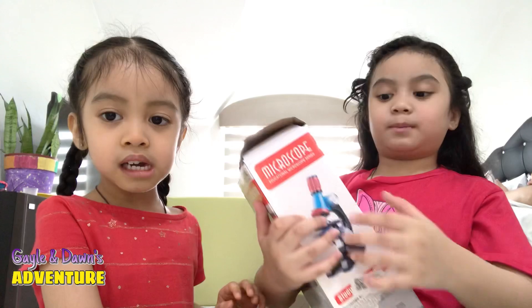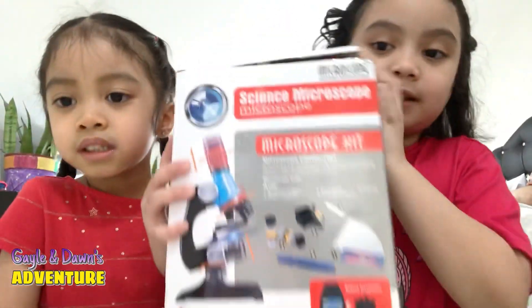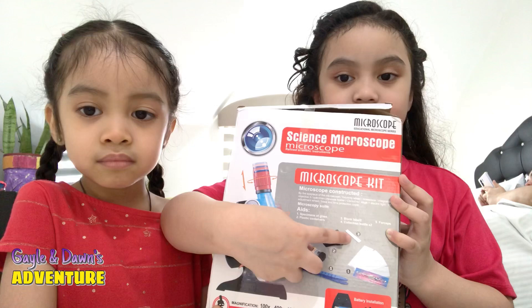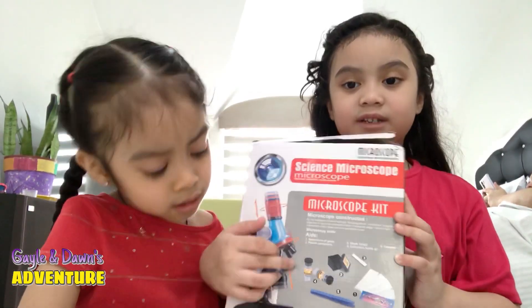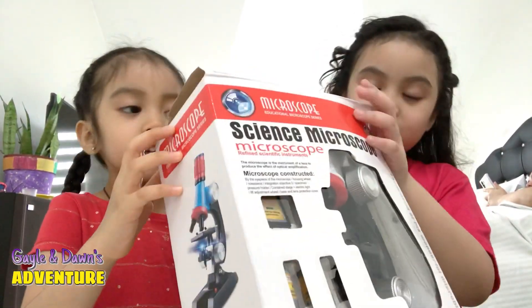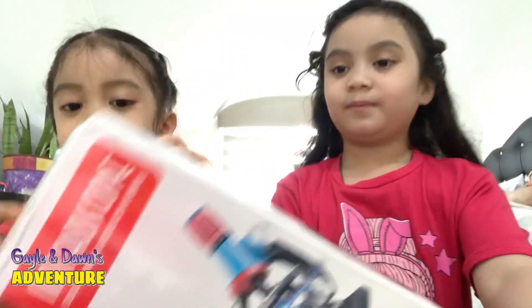...this science microscope. It's called a microscope. It has the microscope, you can turn it, and then there's a light, and there's a box. There's like glass and there's two bottles. Let's get started — oh my god, open it! Oh my god, the box is destroying it. Oh my god, we got it open!